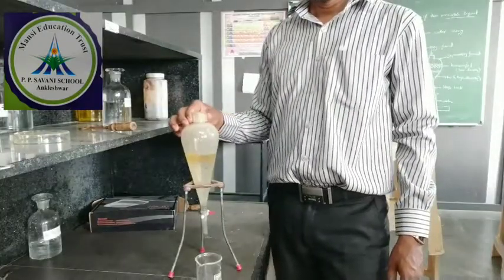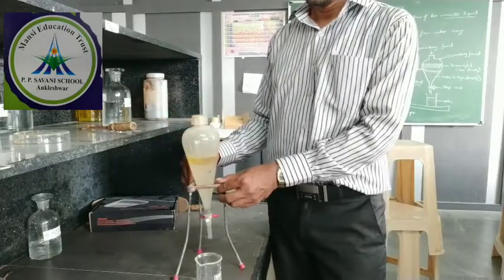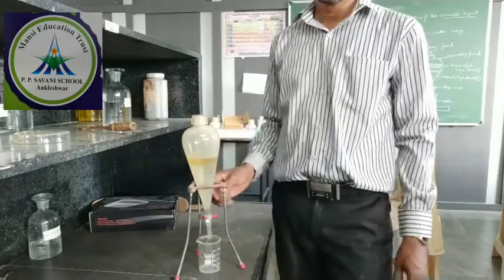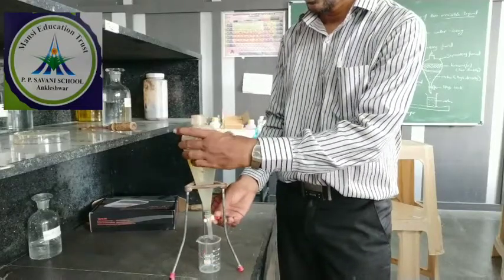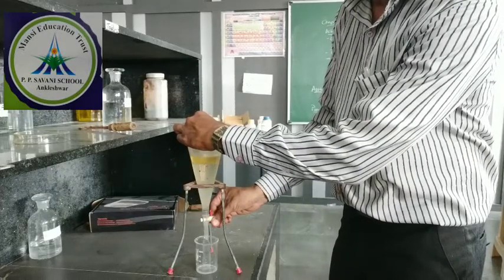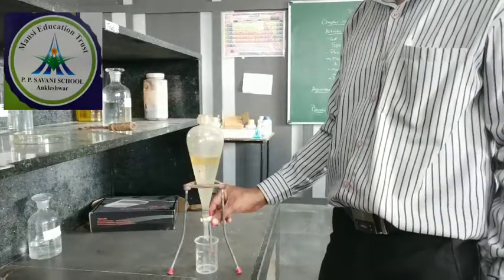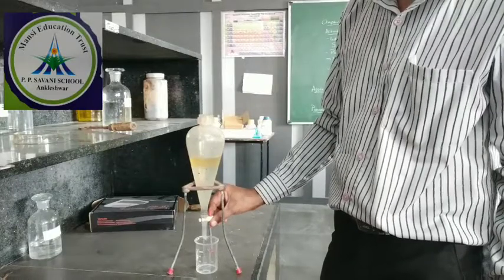This is the separatory funnel I have arranged in the stand. Now I will collect the lower water by opening the knob. You can see I am opening the knob slowly. The water will come out first. You can see water is coming out.